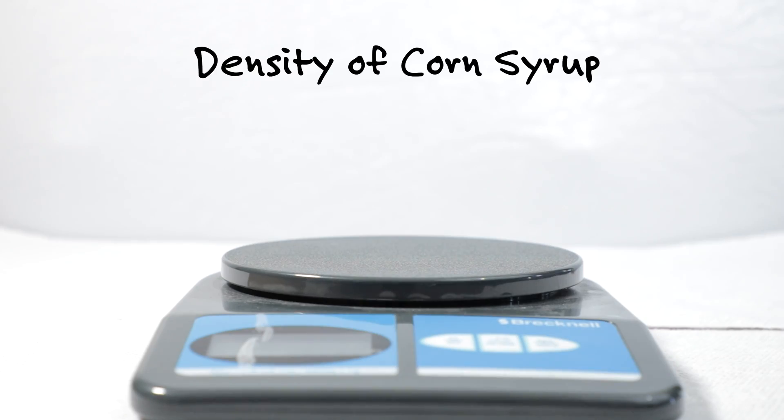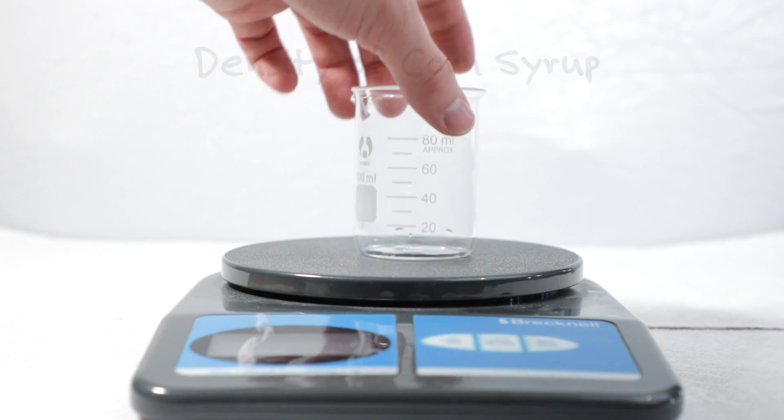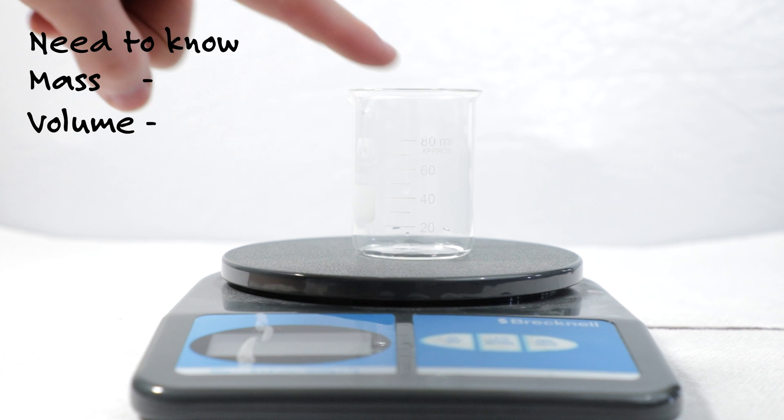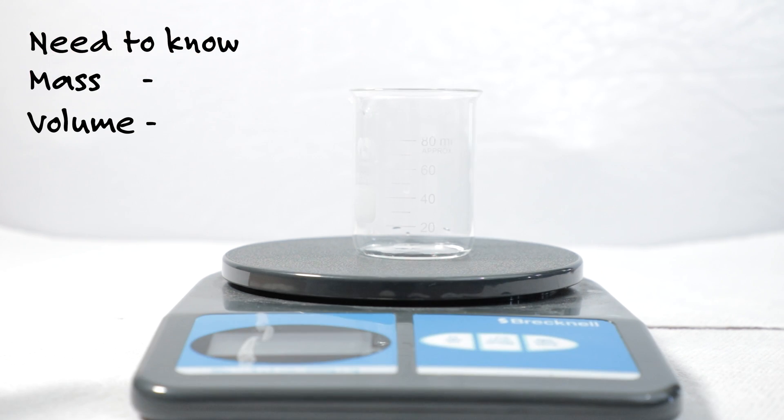Let's see how this works with an experiment. To calculate the density we need to know the mass and volume of our corn syrup. So let's first measure out the mass of our container since we are only interested in the mass of the syrup. My beaker weighs 48 grams.